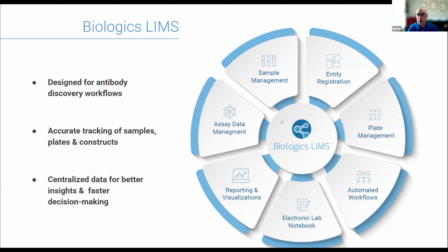So ours, LabKey's Biologics LIMS, was originally designed for antibodies in particular, but we support other kinds of biologics that you might discover and develop. We have all these myriad components or tools within that we'd like to talk about. Extensive sample management tooling, the ability to capture information about all of the various entities that you may be working with through your scientific process, the ability to characterize all of those different samples through assay data management, a lot of reporting and visualization stuff, built-in ELN, and much more.